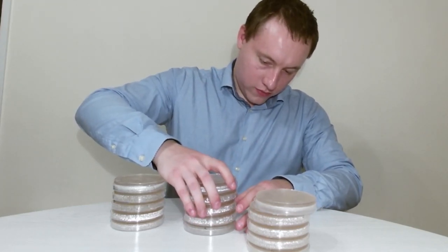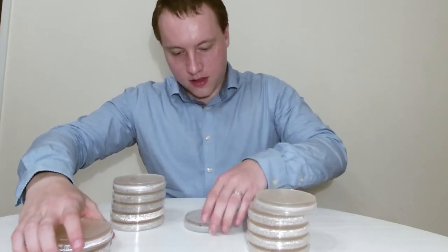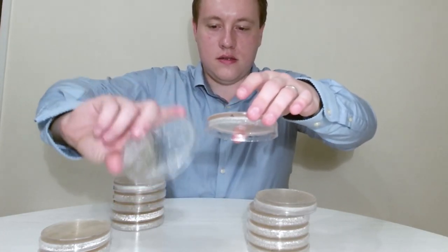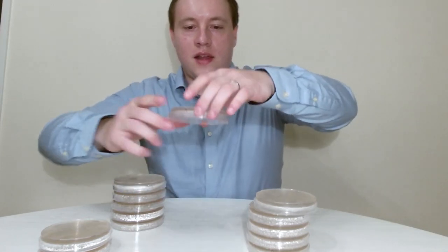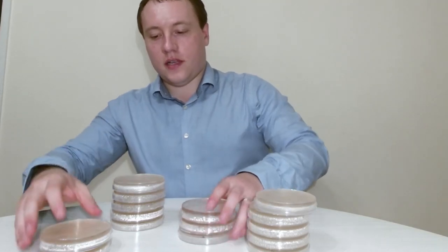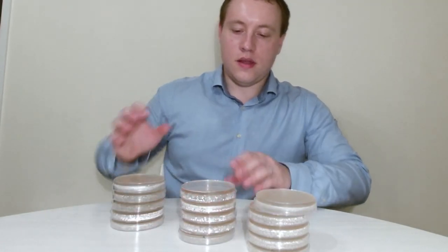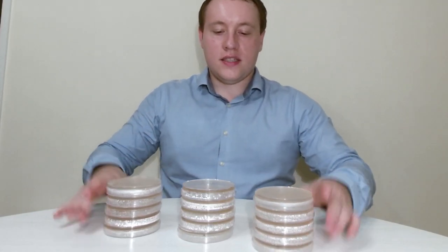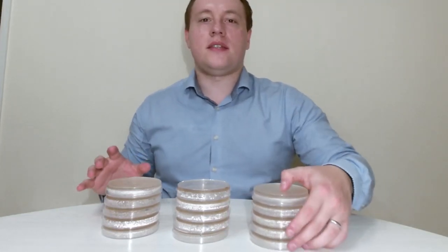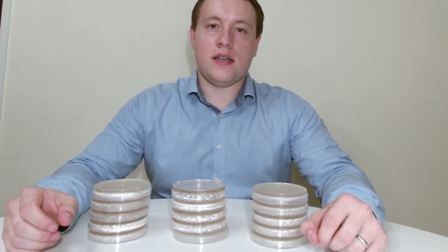We don't want that condensation dripping down onto the plate when we're putting stuff on it. So what we always tend to do is have the jelly layer on top and the lid on the bottom — keeping the plate upside down — to prevent any condensation settling onto the gelatin layer and potentially contaminating any results by adding any extra bacteria or fungi that we don't want.